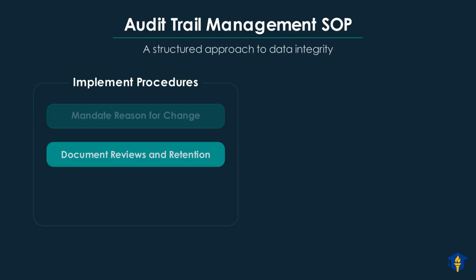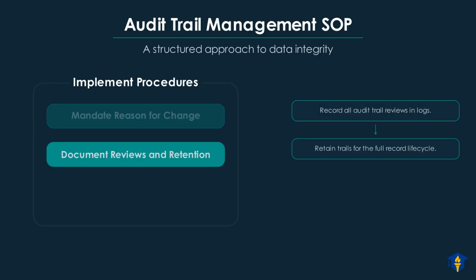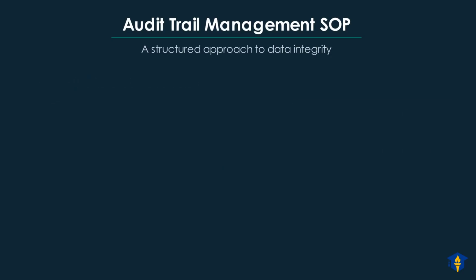Finally, a major step is to document all reviews and establish retention policies. This means recording all audit trail reviews in controlled and secure logs. It is also vital to retain these audit trails for the full record lifecycle as required.